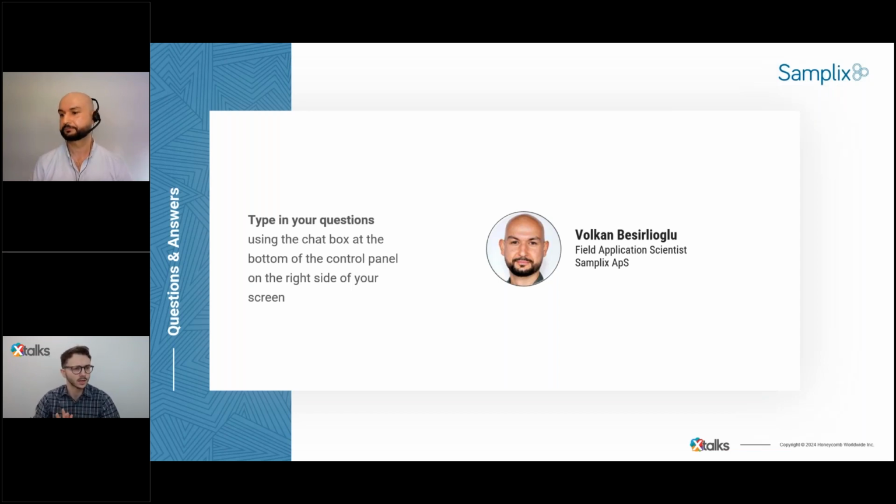It looks like we have time now just for one more question from the audience here. This person is asking, how much time do you save compared to traditional screening? Quite a lot, I would say. If we focus on the single assay droplets that were screened, it's a lot of time.